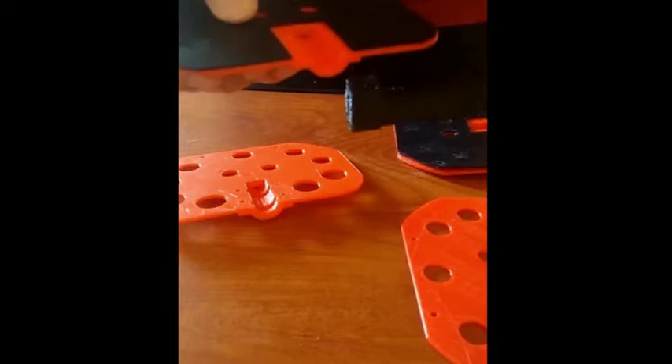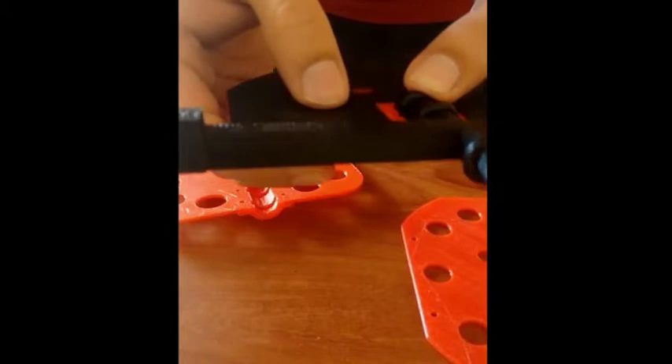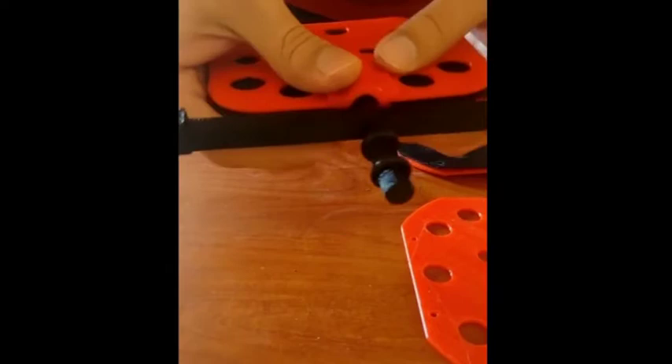The first step is to properly attach or slot in the O-rings at appropriate slots, as you can see here. Then complete the whole circle around it by putting another rotisserie over it. Once you're all set, you will be able to hold it well and rotate it as it's supposed to.